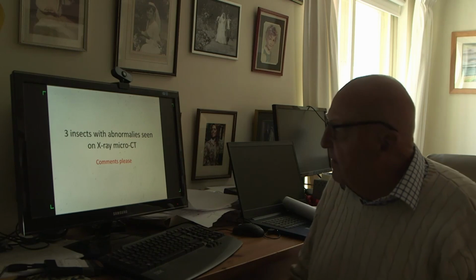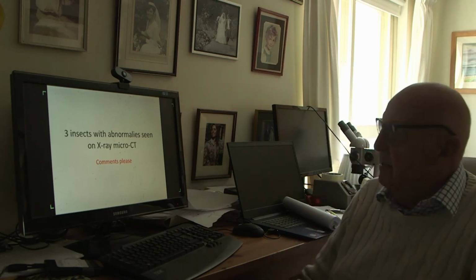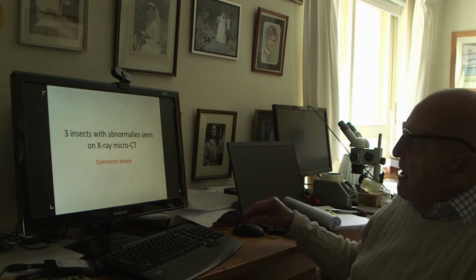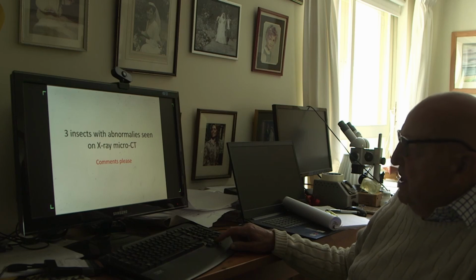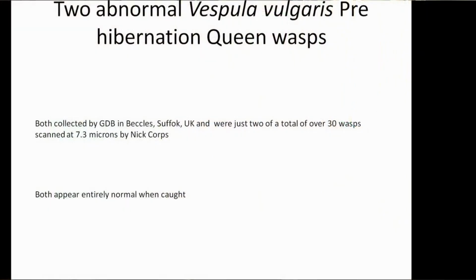So in this video I'm going to be inviting comments on abnormalities seen in 3 insects on micro CT. The first 2 are the wasp.